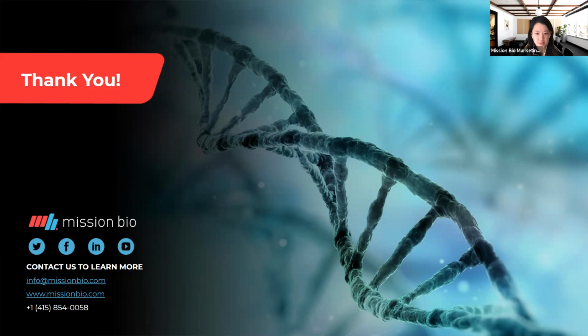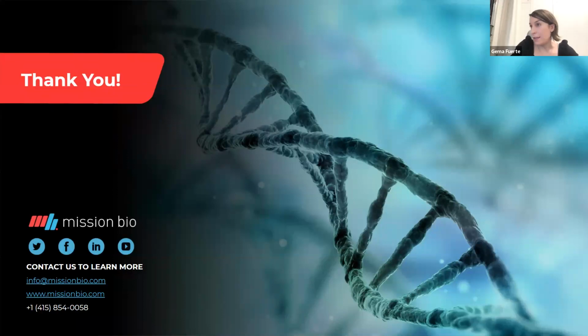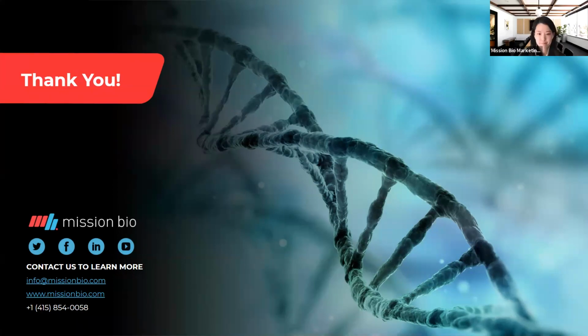How many samples can be analyzed in the Tapestry platform simultaneously? So in the Tapestry Insight 3.0, you could add multiple time points. So the idea is that the samples you analyze together belong to the same patient. So if you have, for instance, 4 or 5 different time points, you can analyze them together, but all from the same patient. That's where you will get the best of it. Got it. Okay.